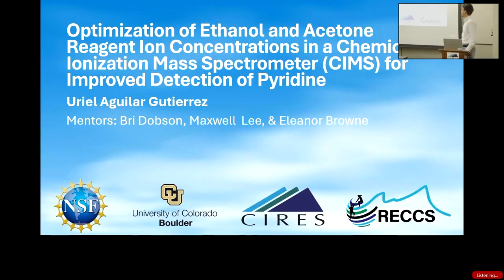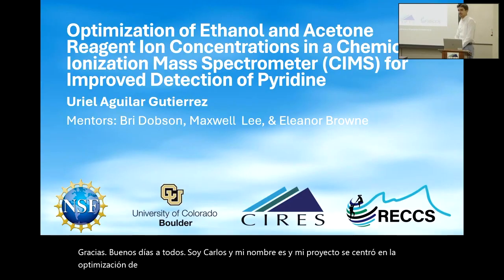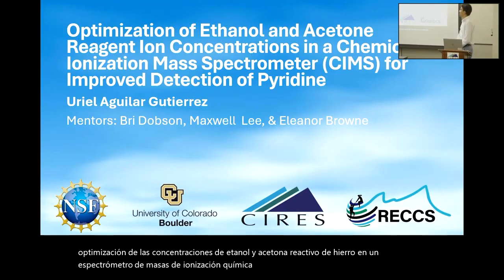Good morning, everyone. Like Carlos said, my name is Uriel Aguilar Gutierrez, and my project focused on the optimization of ethanol and acetone reagent ion concentrations in a chemical ionization mass spectrometer, also known as a CIMS, for improved detection of pyridine, which is a lot to say.